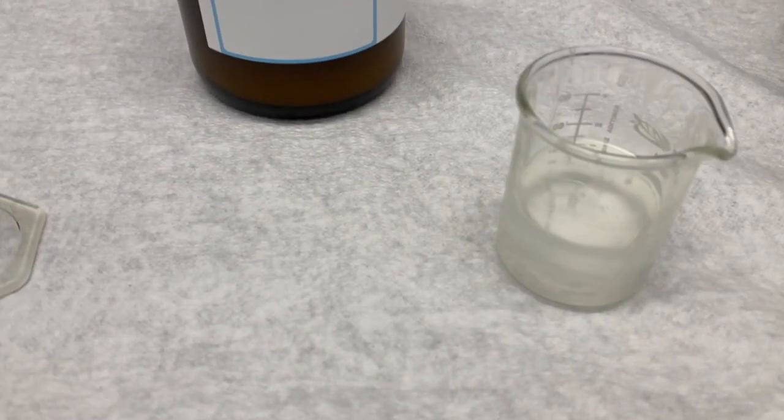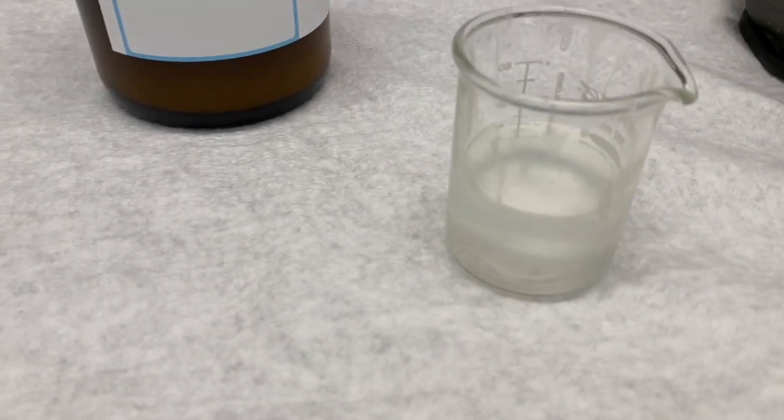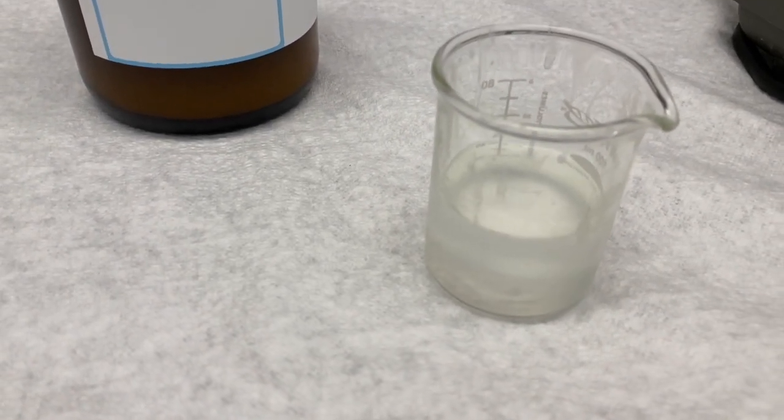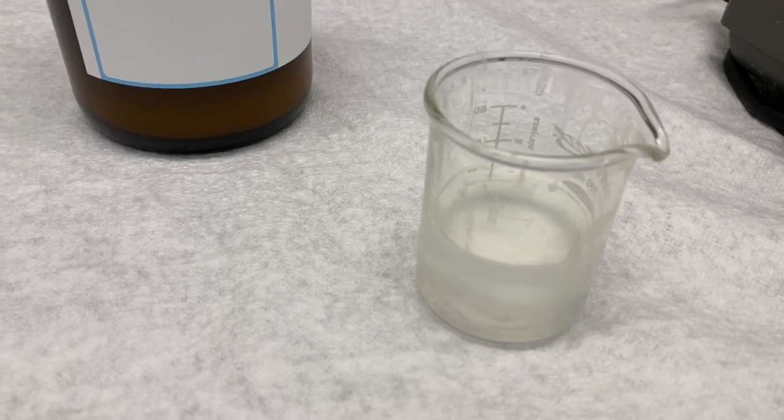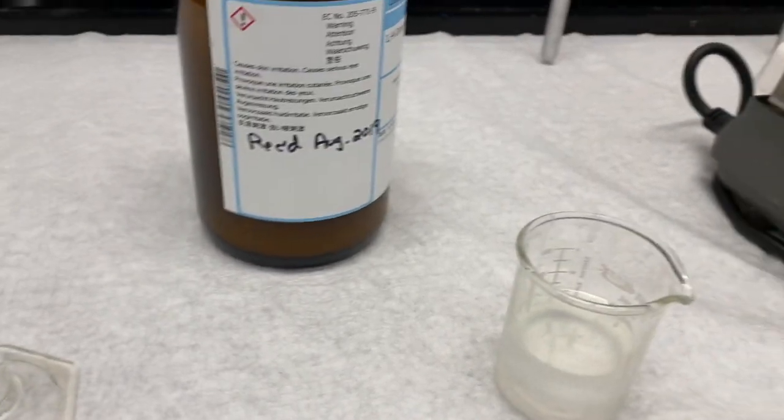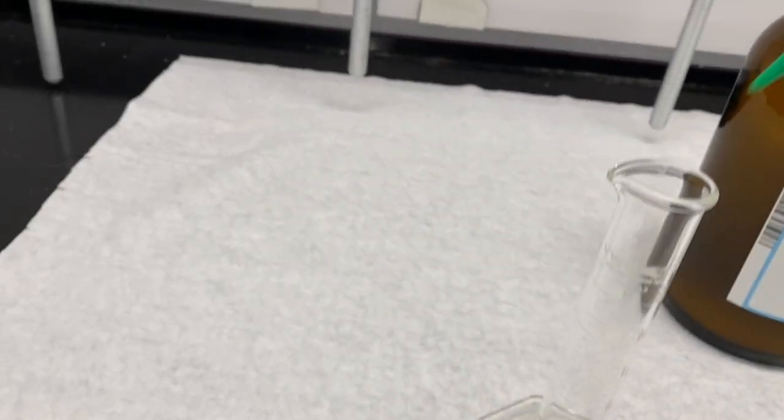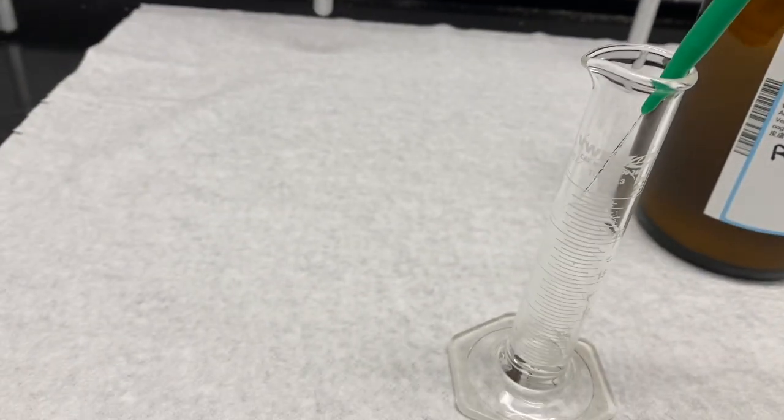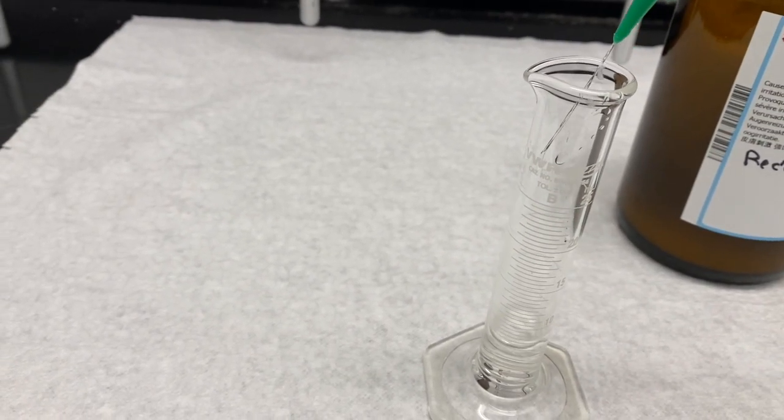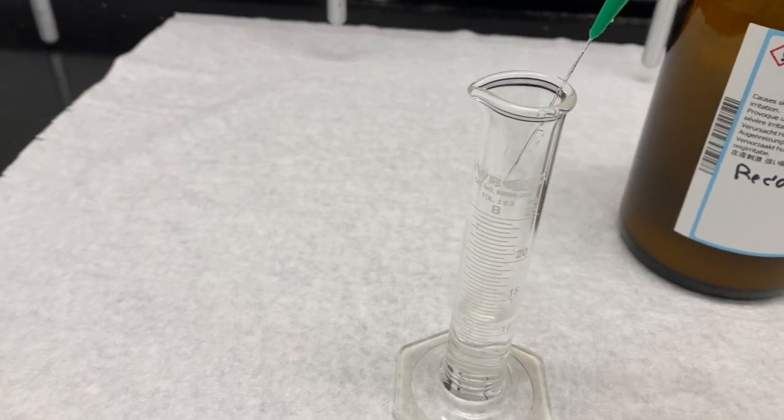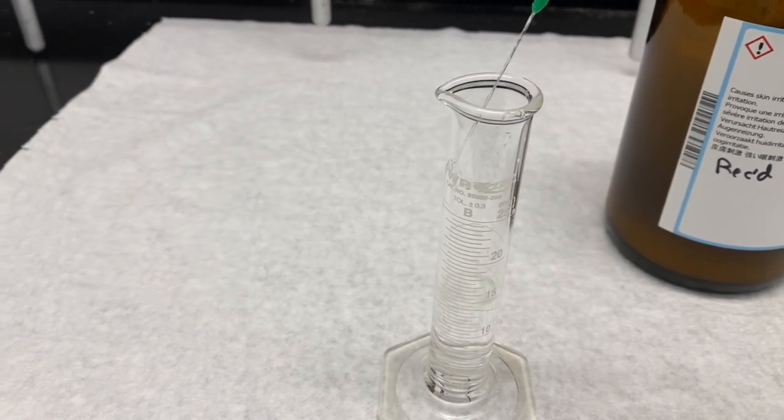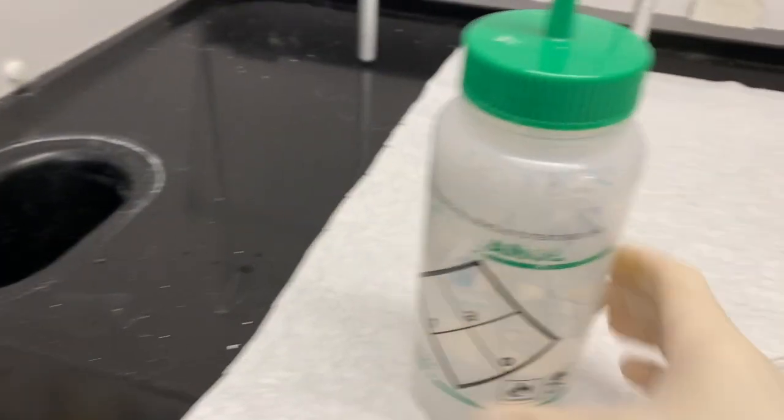So now we have our solution that has been filtered away from the drying agent. And that's sodium sulfate. And now we're ready to recrystallize. So we're going to add, this is about 15 milliliters of methanol. And our product is not going to be soluble in methanol.